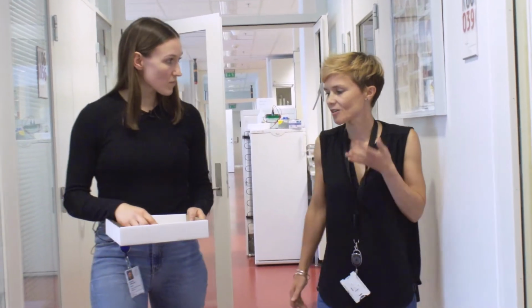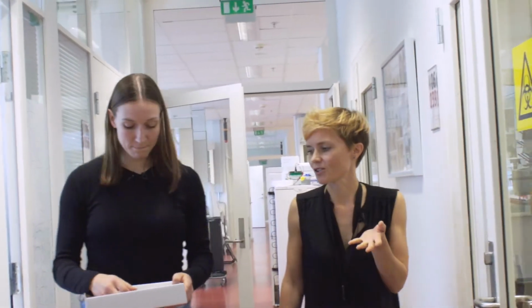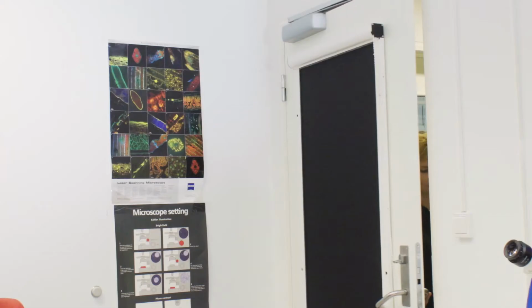One of the really nice aspects about the flies is that you don't have to genotype every generation. With the flies, we can really follow traits. You can follow your gene because maybe it's attached to a phenotypic trait like the wings being curly or the color of the eyes, and so it's really great and it goes very fast.